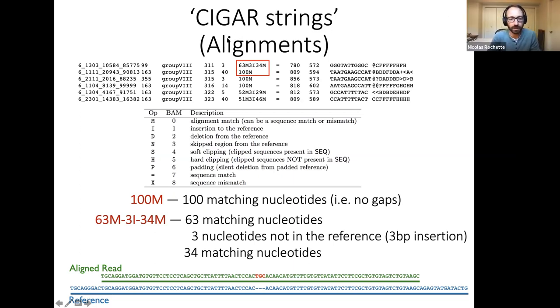And really the goal here is not to have you learn by heart what's in the SAM files or the BAM files, but just so that you have an idea of what information is there, how this relates to what we can see in an interactive browser like IGV, and really what task the aligner is trying to accomplish.